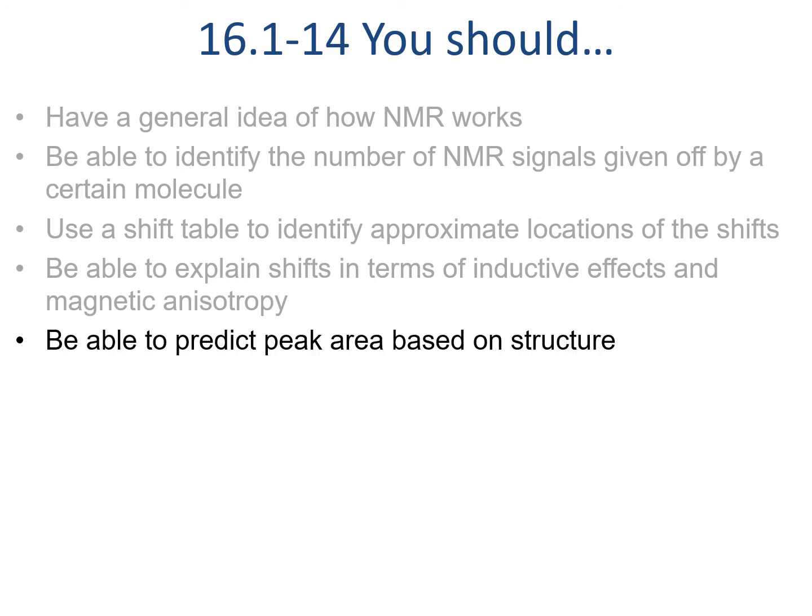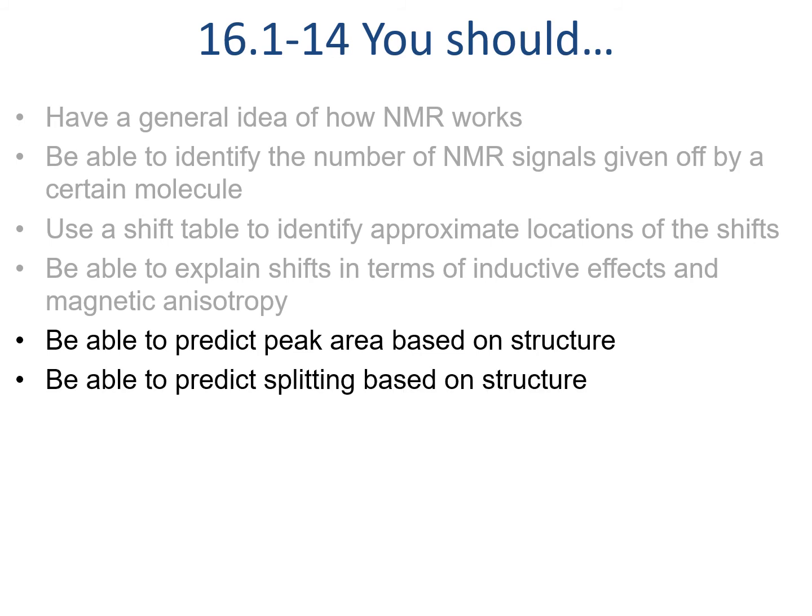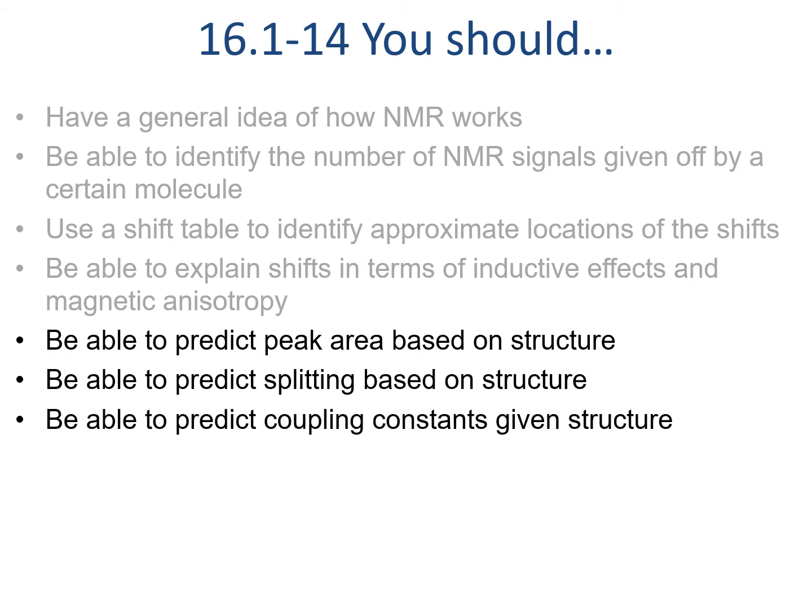Now, after this lesson, we should be able to predict peak area based on structure. So if you have more protons, we'd expect more peak area. And we should be able to predict splitting based on structure. If we have n neighbors, we should have n+1 peaks. And we should also be able to predict coupling constants given the structure using a table for that.